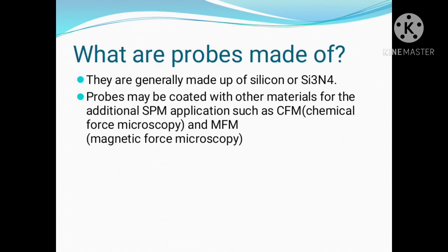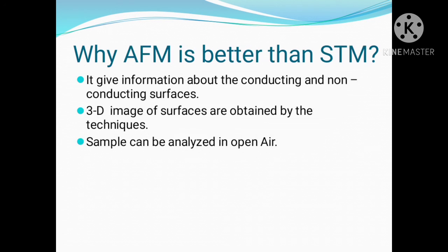Next, what are probes made of? They are generally made of silicon or silicon nitride. Probes may be coated with other materials for additional SPM applications such as CFM, chemical force microscopy, and MFM, magnetic force microscopy.